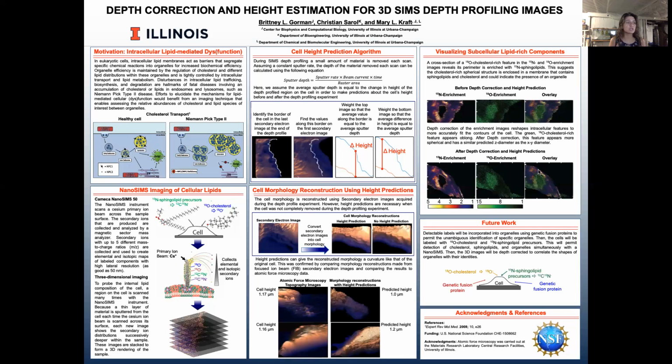However, in order to confirm that, some of our future work will be utilizing genetic fusion proteins in order to incorporate distinct labels that can be detected with NanoSIMS at the same time as we're detecting these lipids.